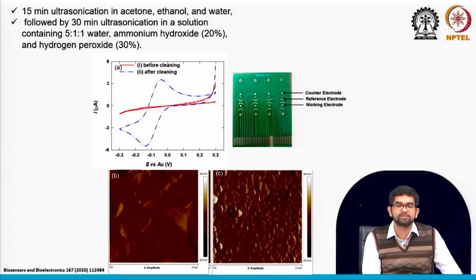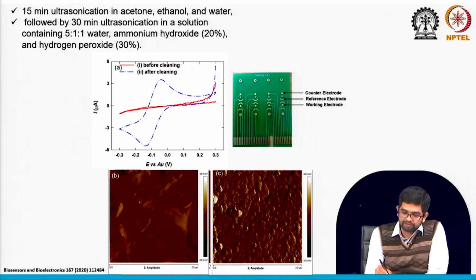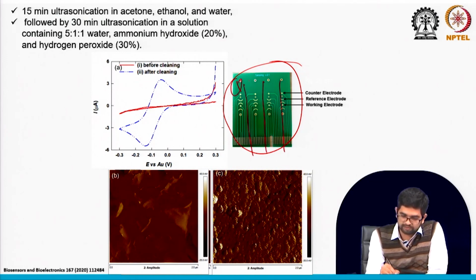But now I will show you a few pieces of information here. This is an example of a printed circuit board. You can see this is a multiplex printed circuit board, 1, 2, 3, 4, like 4 channels.